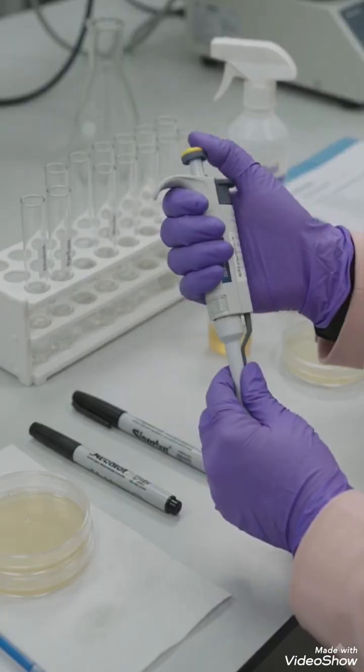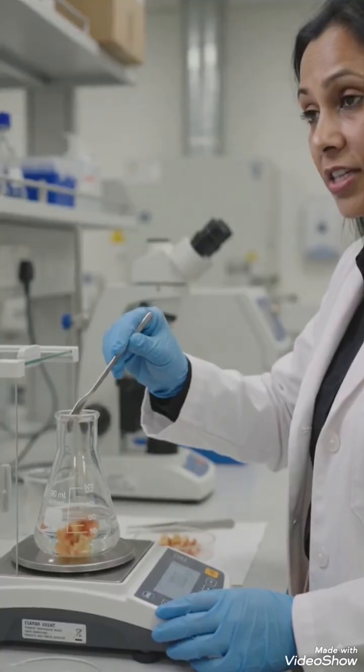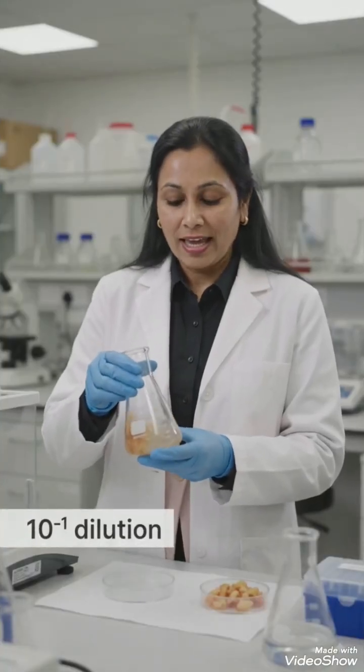Welcome to our lab session. We have all our materials ready. Here are the agar plates and spreader. Let's begin our sterile dilution. Take 10 grams of food sample, add it to 90 milliliters sterile diluent. This forms the first 10-fold dilution or 10⁻¹ dilution.